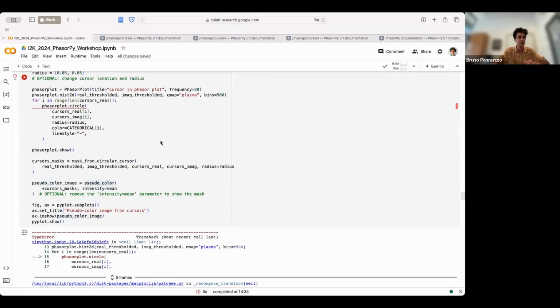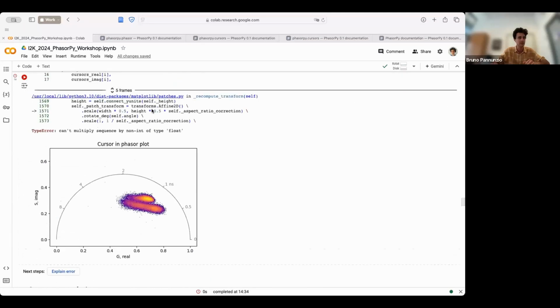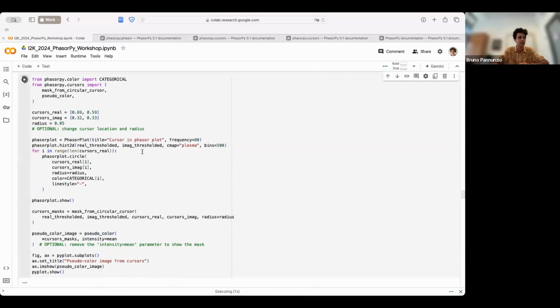So an error comes here. Well, maybe it's here.